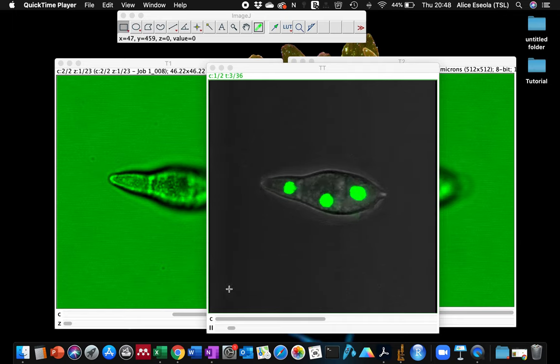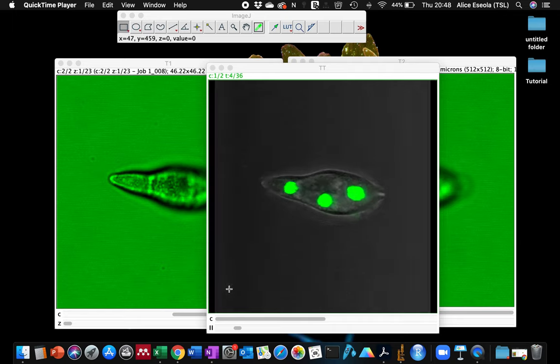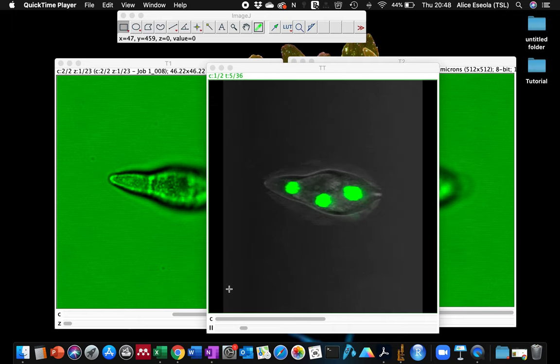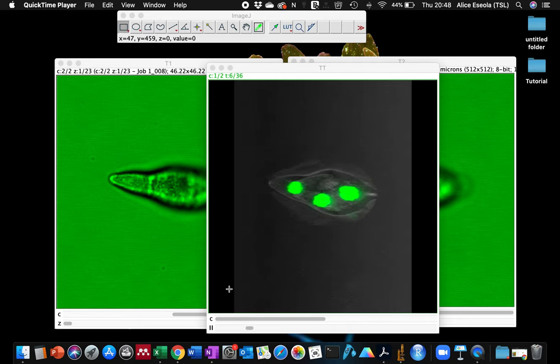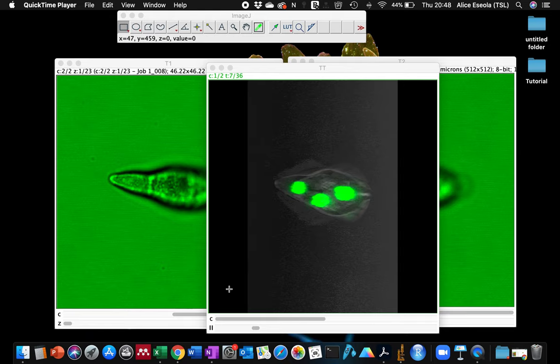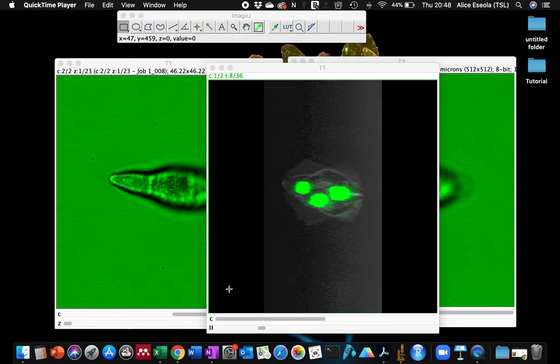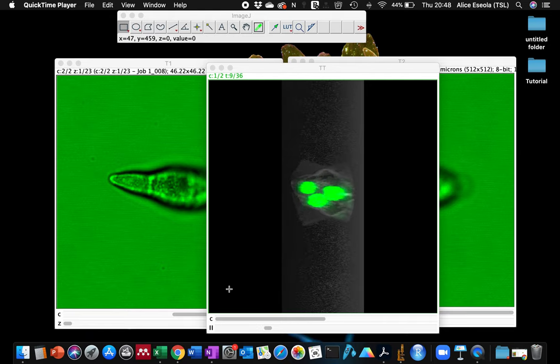Welcome back to my YouTube channel. Today I'm going to show you how to make a 3D projection of your Z-stack in ImageJ.